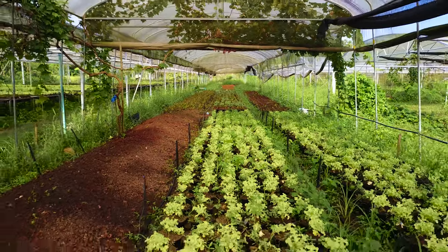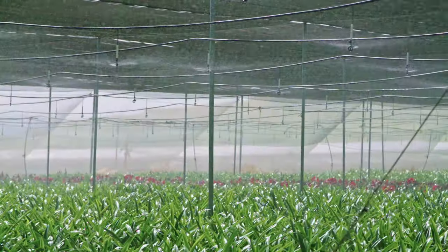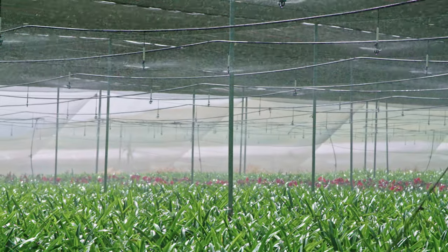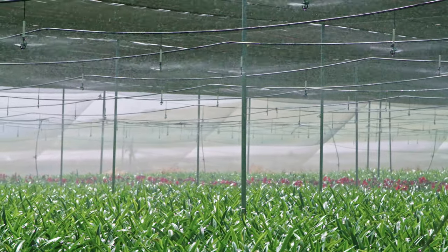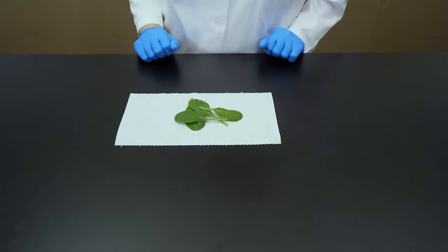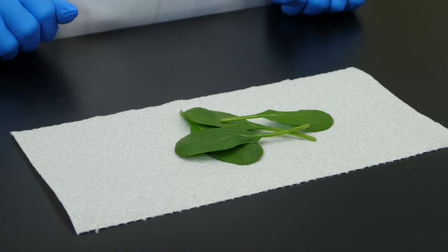It is not possible to see photosynthesis at work because it happens on a molecular level, but we can see the effects of photosynthesis in this experiment. To demonstrate that photosynthesis produces oxygen, we need some fresh green leaves. For this experiment, we will use baby spinach leaves.